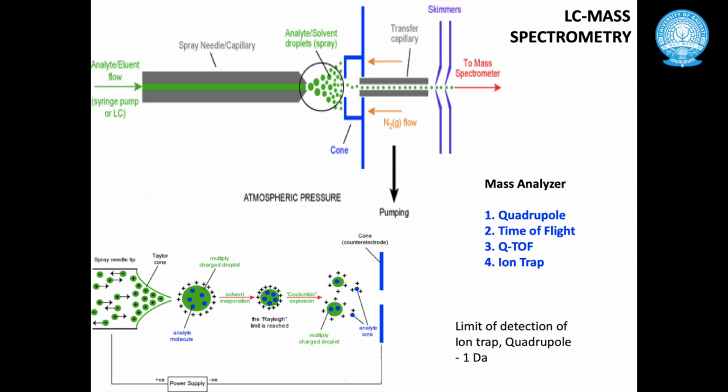Okay, the spectrum of a compound in mass spectrometry looks like this. It is called a mass spectrum. For the anthocyanin compound which we discussed in the previous slide, if we analyze it through mass spectrometry, the spectrum we will get is like this.